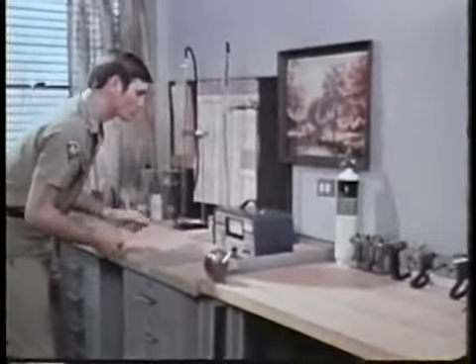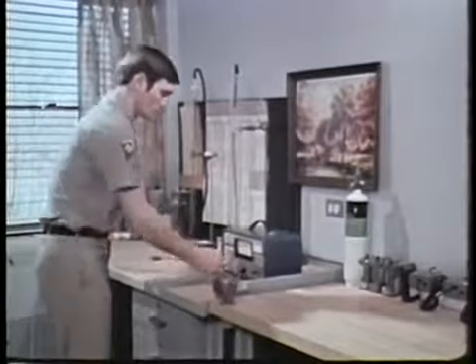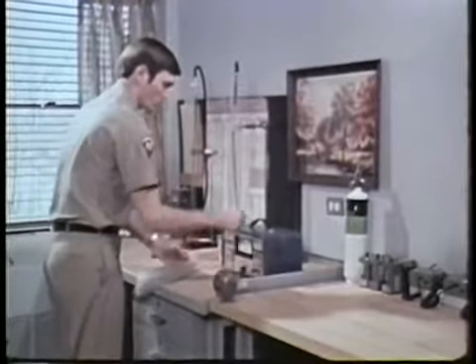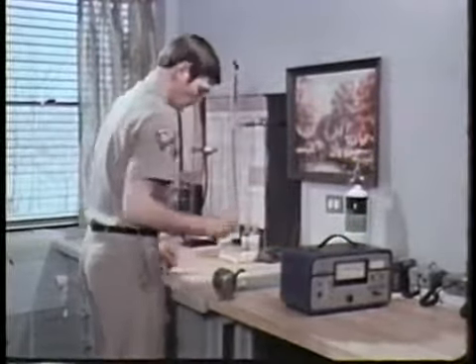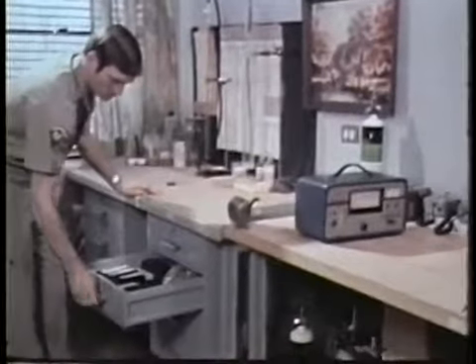With the flow rate adjusted and the calibration set, the analyzer is ready for use. These adjustments should be made each day you use the instrument, because the settings may drift.